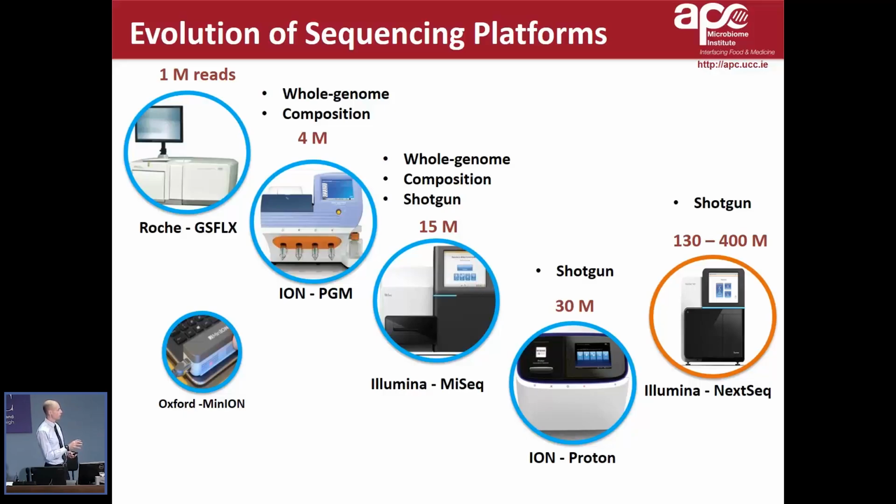The strategy used by that company is quite clever, so they put a lot of money into marketing, but their R&D facility, to my mind, could do a bit more work, but they overcome that by providing these DNA sequencers to people with expertise in the area and allow us to play with them and to optimize them and ultimately improve the product. But they do have newer versions of that instrument that generate even greater amounts of DNA sequence reads as well, and they're likely to be a major competitor for Illumina in the future.